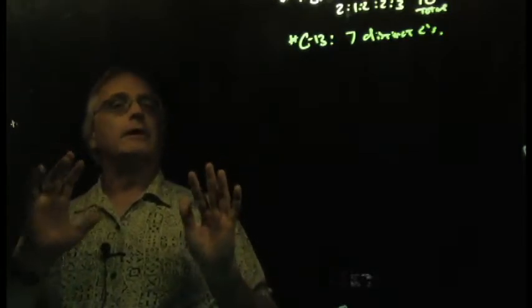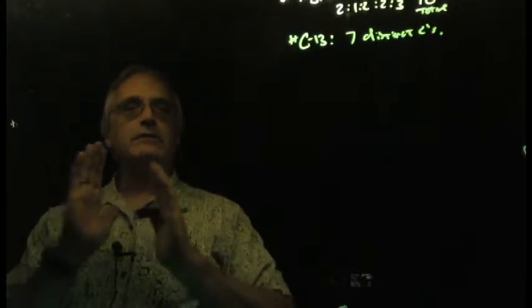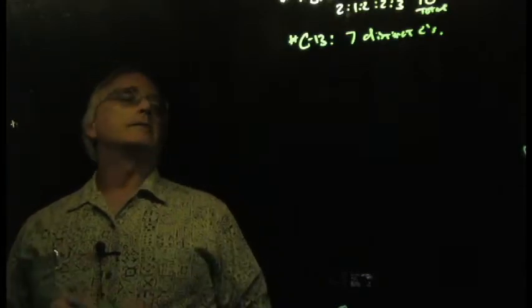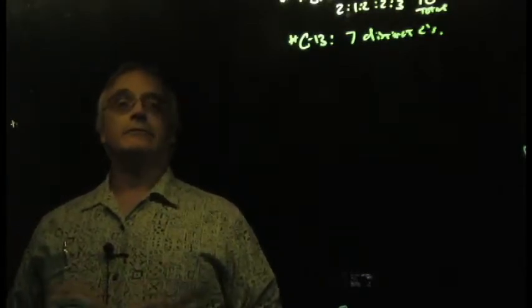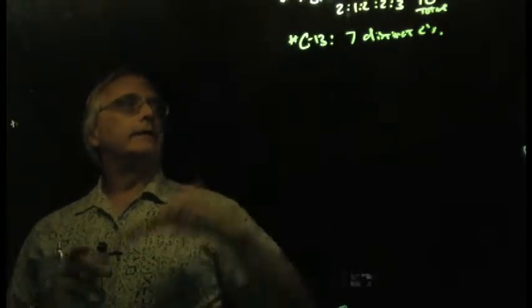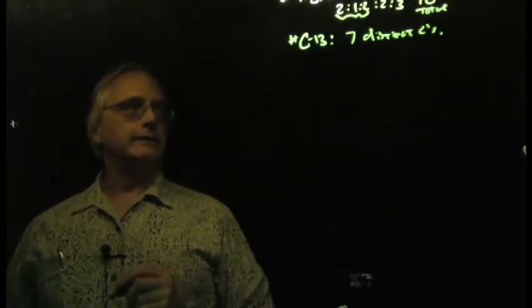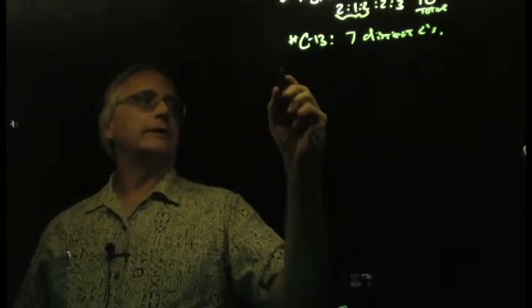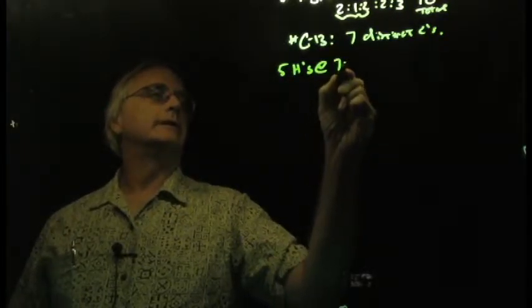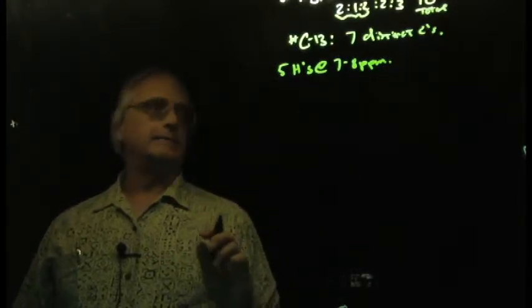Of course, remember, we're trying to learn how to drink from the fire hose of information. We take this very piecemeal, one bit or set of information at a time, and then start putting things together. And the chemical shifts for this thing are very useful. Notice that we have 5 hydrogens at 7 to 8 ppm. Okay, 5 hydrogens, 7 to 8 ppm.